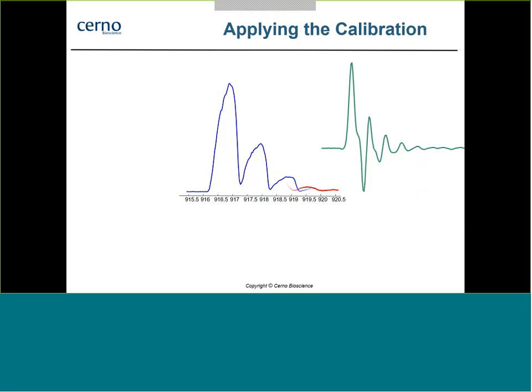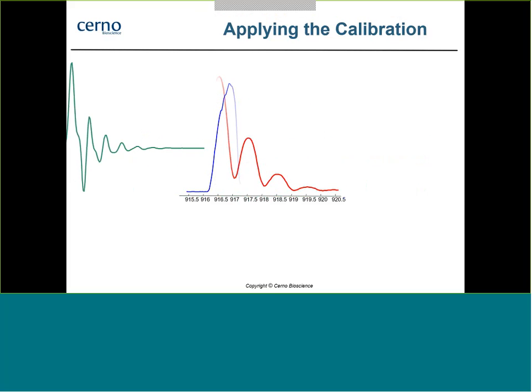And that's just shown here. This is how it works. Very simple. It's a convolution. We've now corrected our measured, imperfect mass spectrum to a mass spectrum that is corrected not only in mass accuracy, but also in its shape, in its known shape, spectral accuracy. And this has huge advantages, as we'll see.